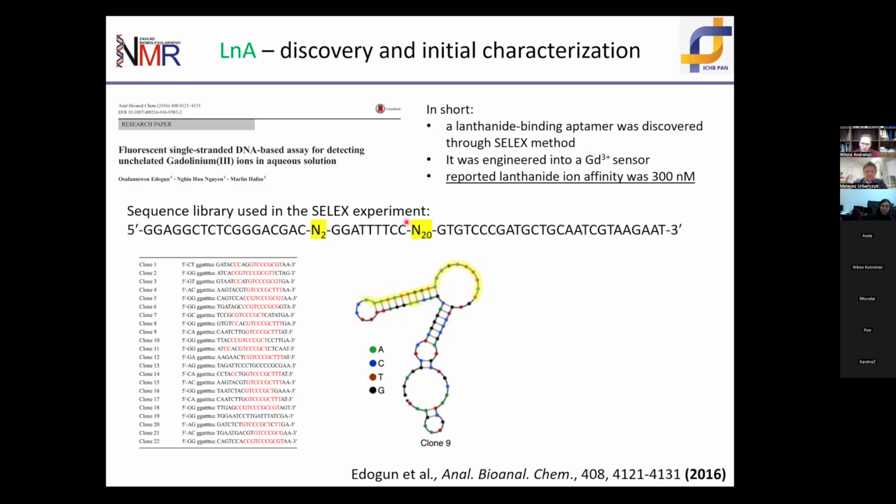So this is a very powerful method. You don't have to know anything about how to get the two molecules to interact. But in the end, you also don't know why they interact. Yeah, but you know already what interacts, so I think it's already quite a lot.